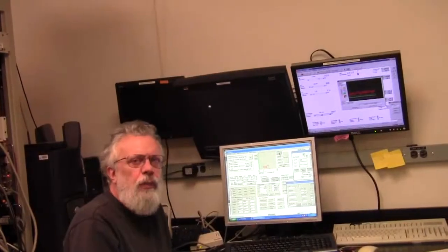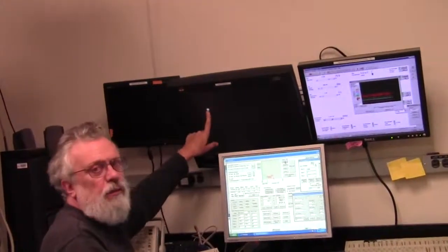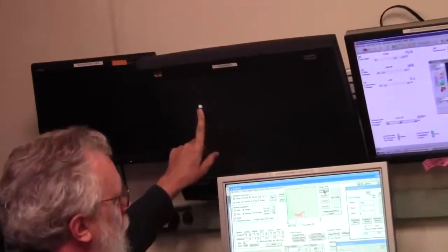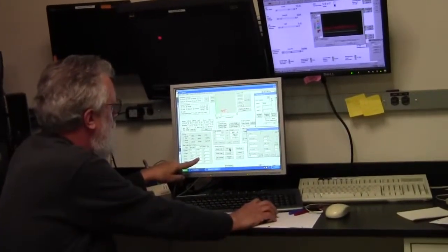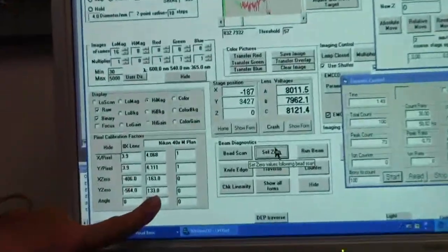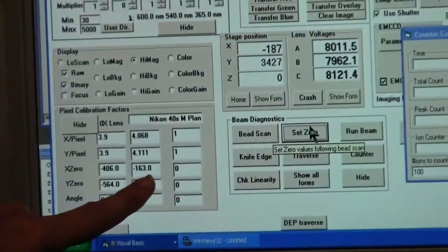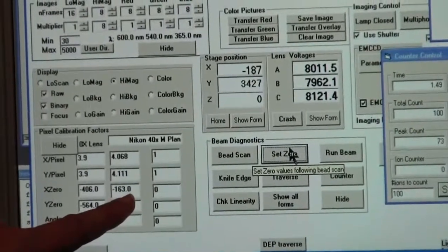So now we're looking at the bead with a high magnification lens. We've taken a picture of it here again on the same screen and we tell the computer to find the center of that bead and now it knows the center of that bead and we'll go down to this screen and transfer those coordinates so that the computer can use that location to position cells over the beam for the actual radiation.